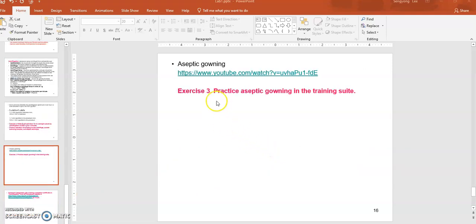And then exercise 3 is practice of your aseptic gowning process. I want you to go to this website, a YouTube video, and play it. It will explain how you do the aseptic gowning step by step. It's a very good video. Some of you may have already watched it in your previous class, BIOT 100 or BIOT 102. If that is the case, then you will understand the process. But if you haven't watched this video, it's a really good educational video.